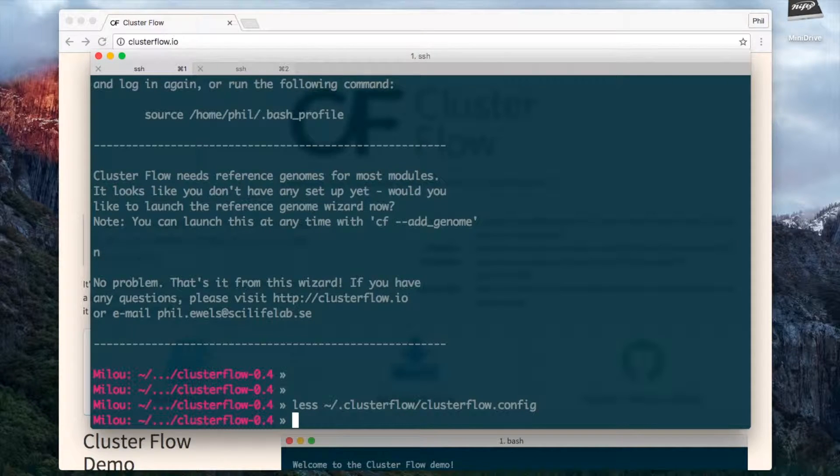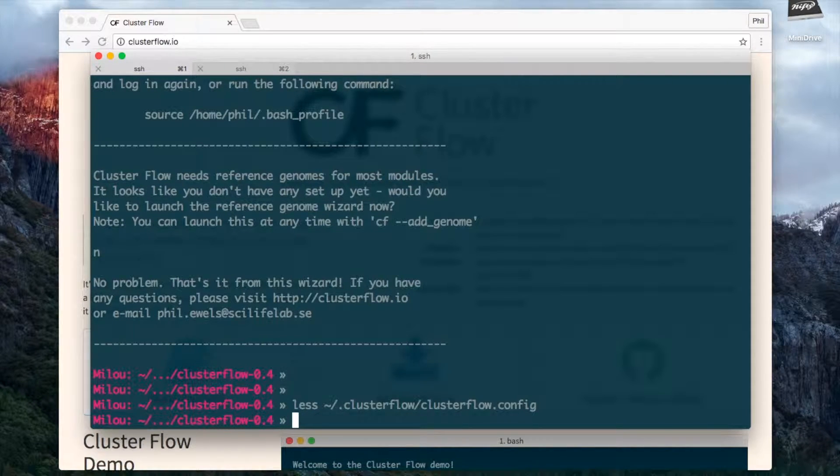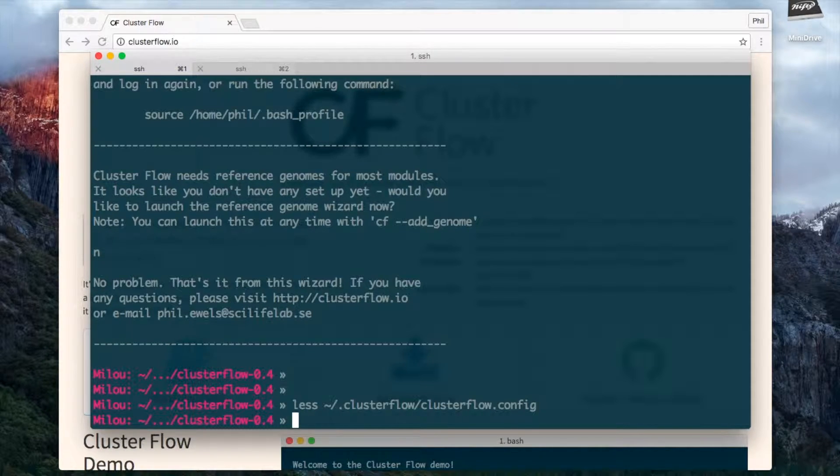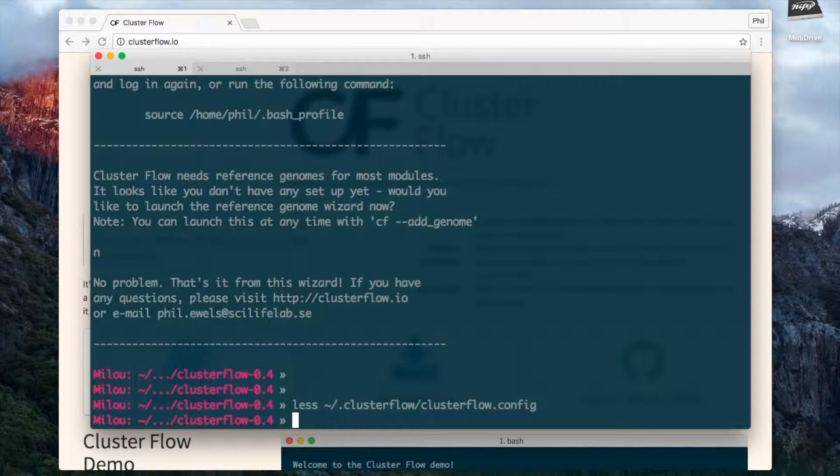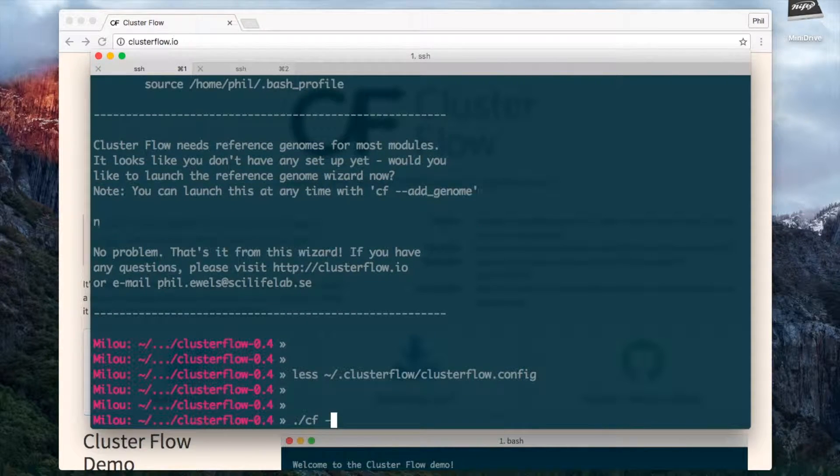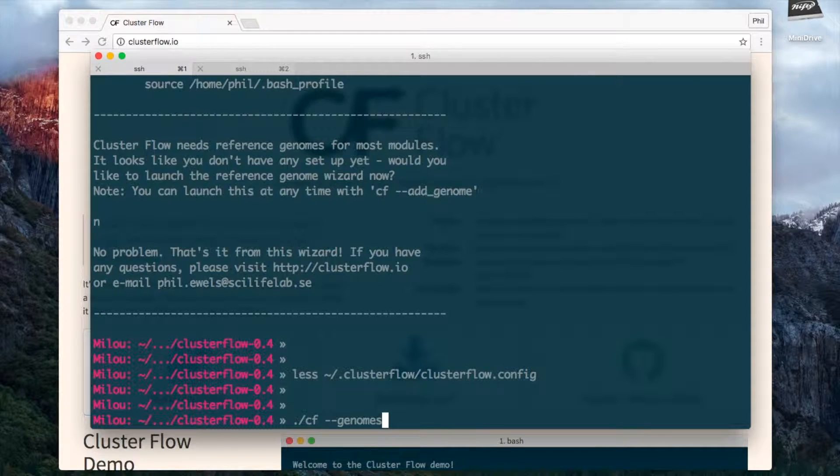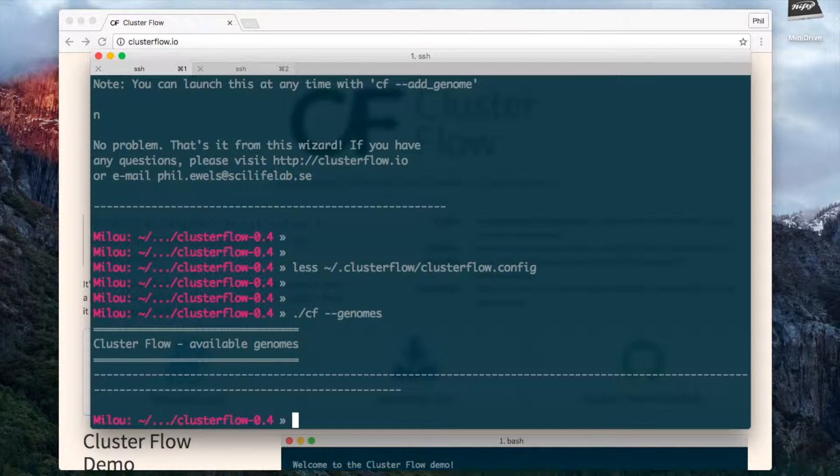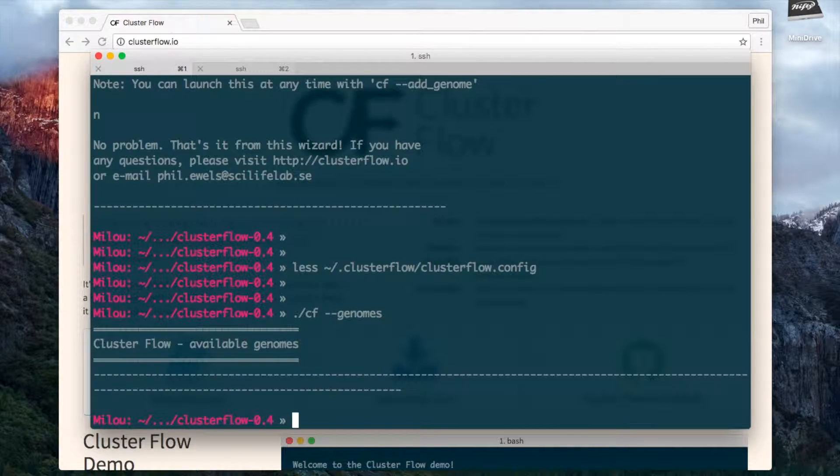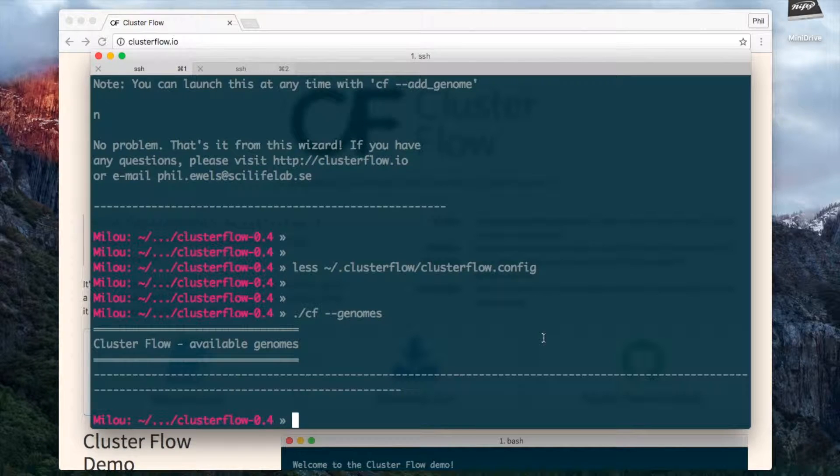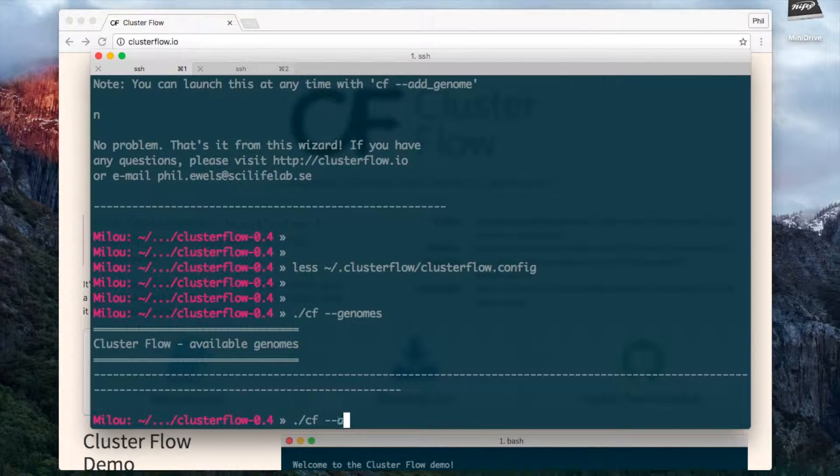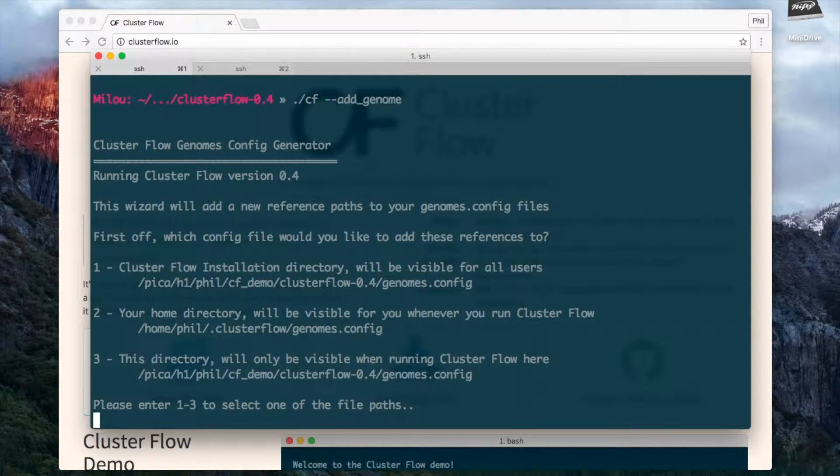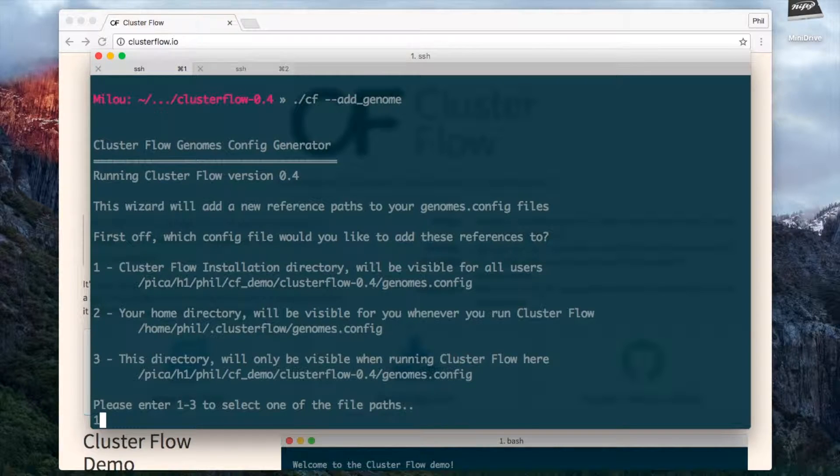Next, Clusterflow has a built-in reference genome manager and this is helpful because you don't have to remember the path to your reference genomes and you can use them in a more consistent way. If I do 'cf genomes' here, which is the way to list the installed genomes, you'll see that it's empty currently. There's nothing there, so we can again use the Clusterflow wizard to add a genome. To do this I'm going to use cf --add_genome and again I can choose where to create a config file. I'm going to say in the installation directory.